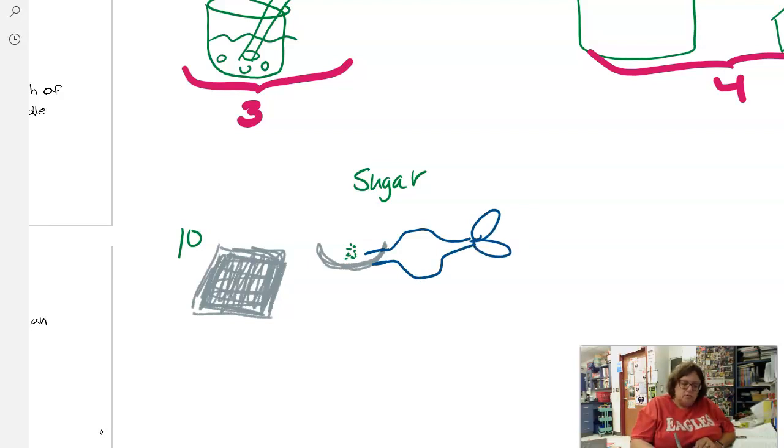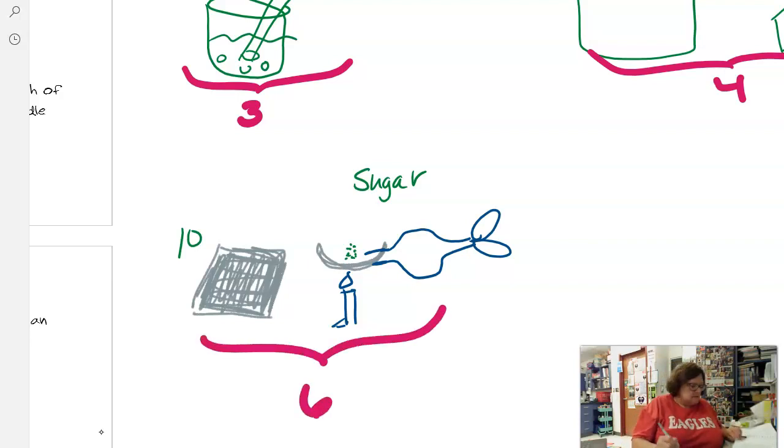So you're going to use the crucible tongs, and remember I said blow out the candle. If you did, relight it. Because you're going to put it over the flame and observe. And then after you've observed, then you can let it cool and you can throw the aluminum foil away. This will be at station 6. Okay?